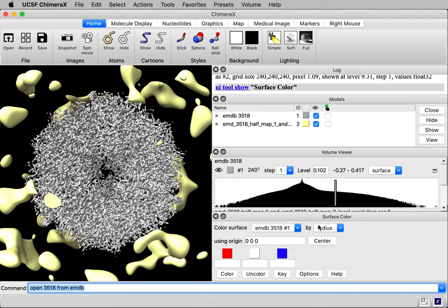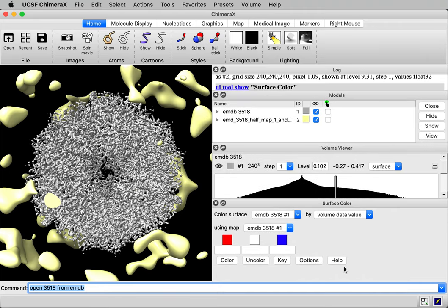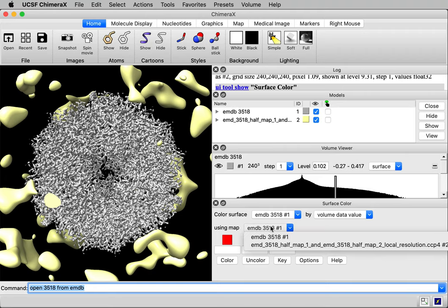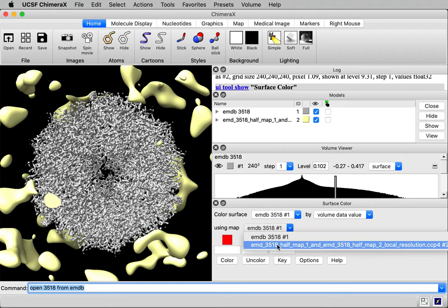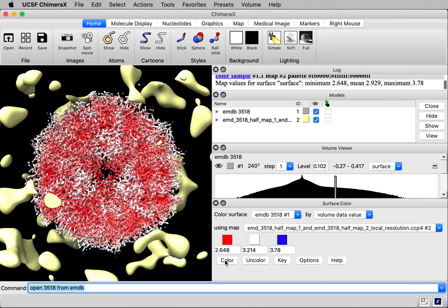It says color by radius. Let me change radius to volume data value. We're going to color it according to the local resolution value, using the local resolution map, and I press the color button.